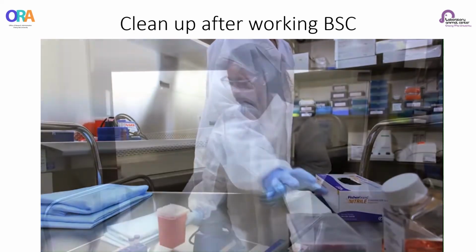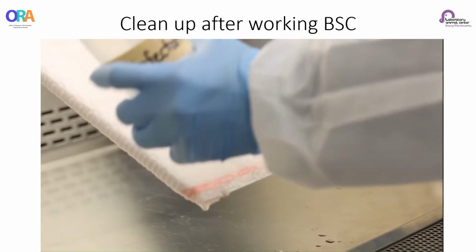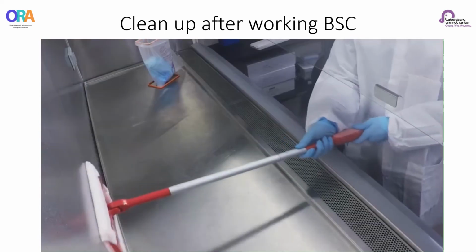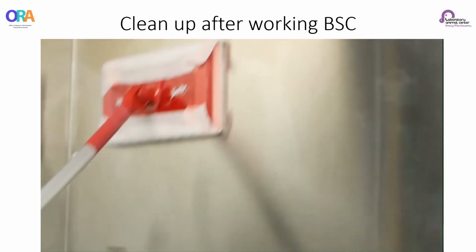After removing everything from the cabinet that needs to come out, proceed to decontaminate the inner surfaces of the BSC as you did before beginning work. Don't forget the sides and back wall, as well as the inside of the glass sash.